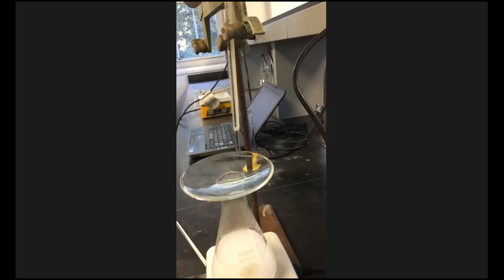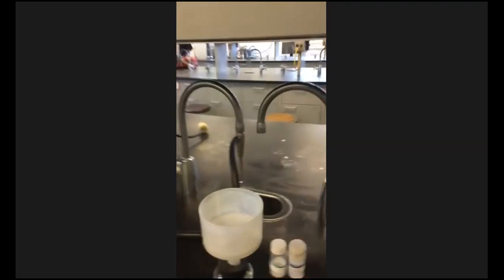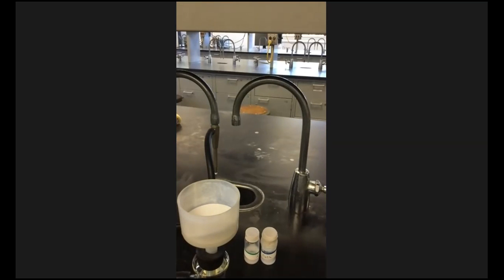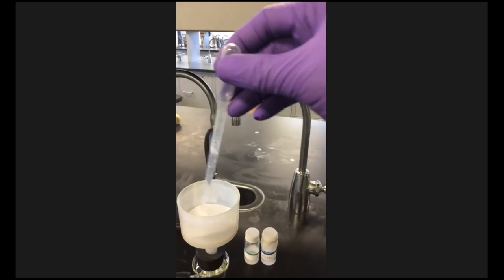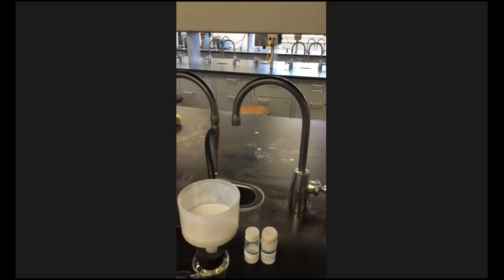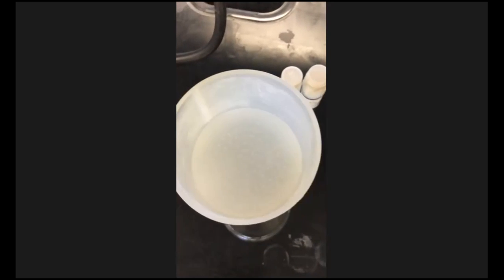And let me go back to here. Normally in your vacuum filtration setup, under normal conditions, you'll take your filter paper that you weighed out and just put it into the funnel, and then you want to seat it, right? Because sometimes it'll move around and you don't want that. So you're going to take a little bit of water and just drip it on there to seat it so that it'll sit flat in the funnel. All right, so you can see the filter paper is wetted, so it'll sit and it won't move around.